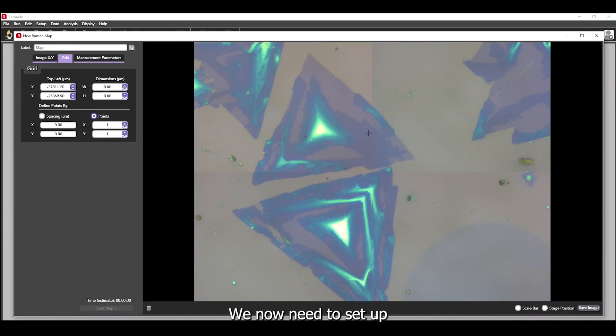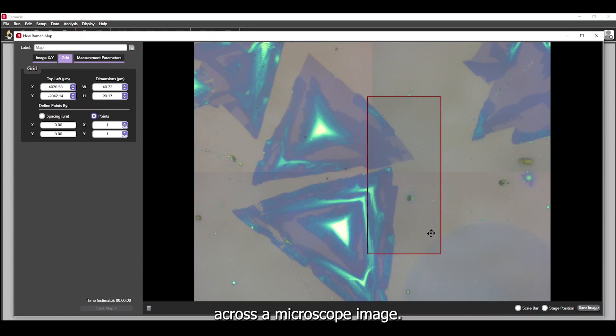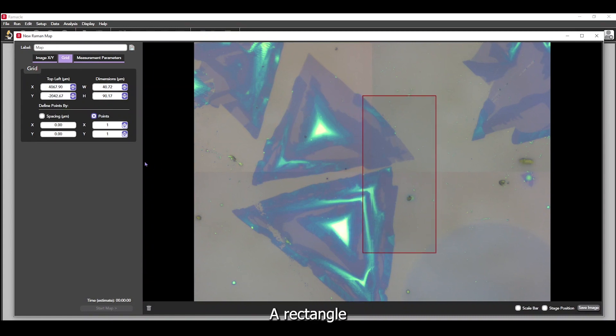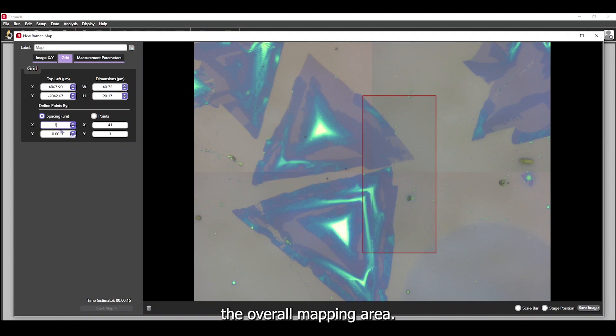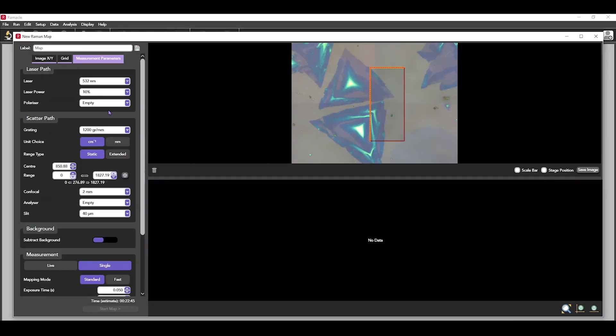We now need to set up a mapping area. This is really easy to do and simply requires us to draw a line across the microscope image. A rectangle then appears that shows the overall mapping area. The step size or number of points can then be selected, which gives us a mapping grid.